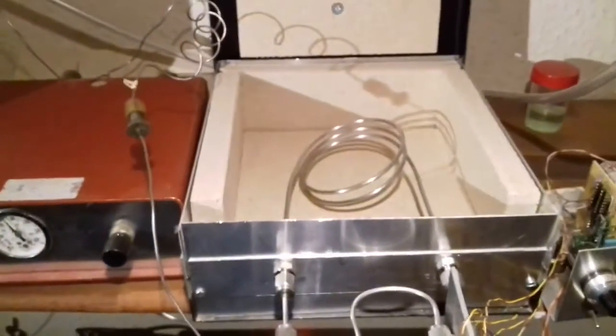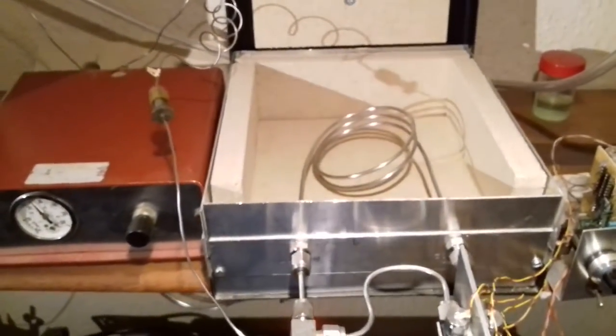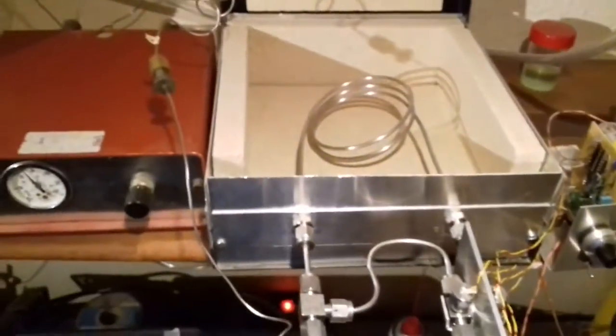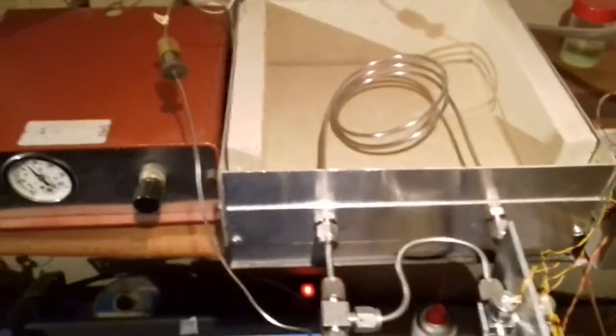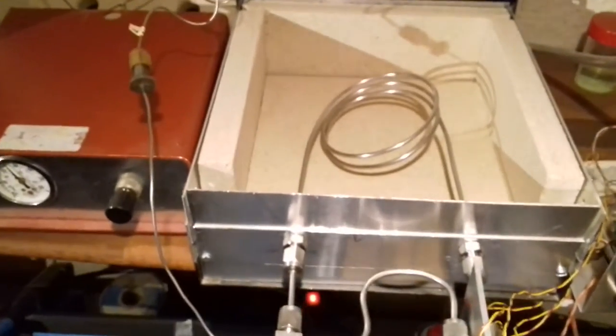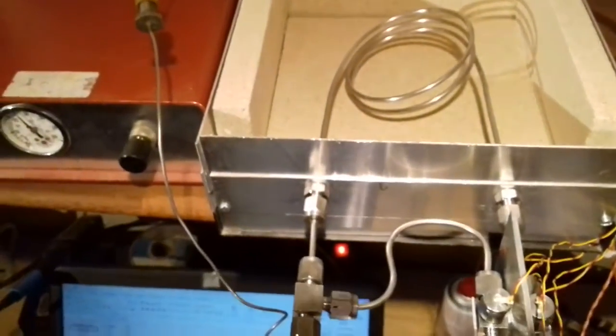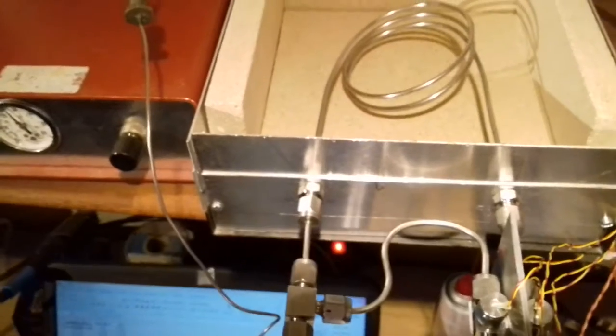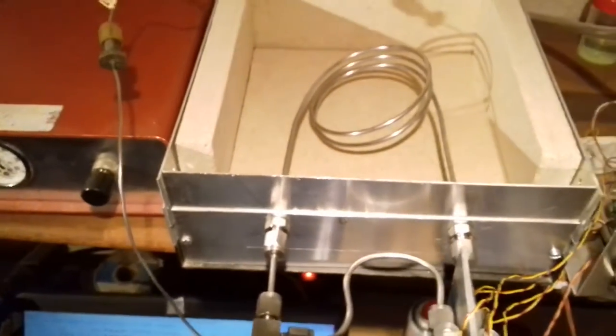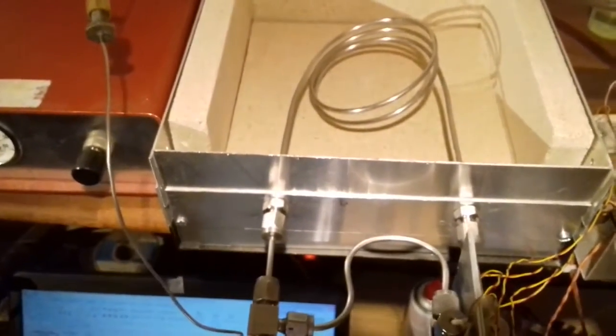There are, of course, many things that could be optimized in this. Most people who've used a gas chromatograph will notice that it's not heated. And that's pretty much an on-starter for 99.9% of the compounds you want to run chromatography on, or gas chromatography on, at least.